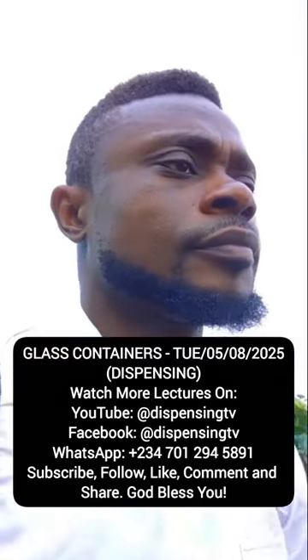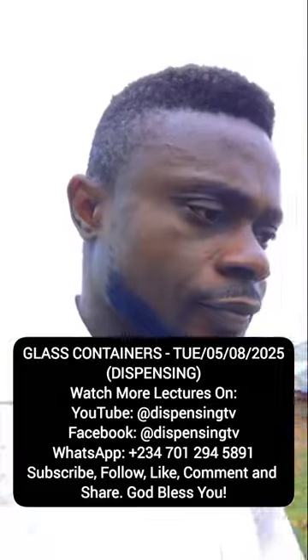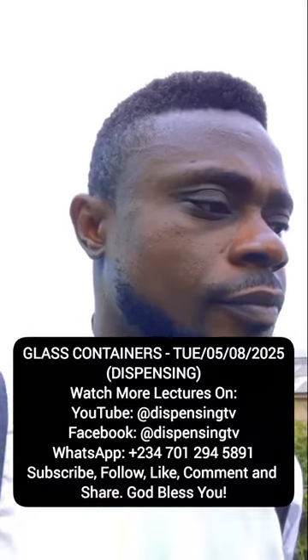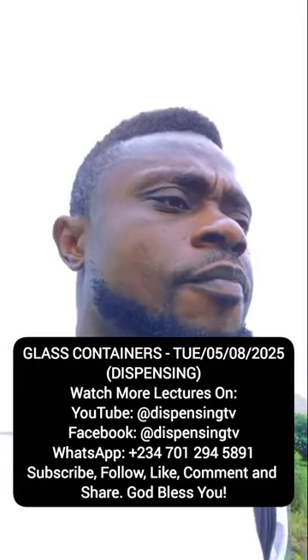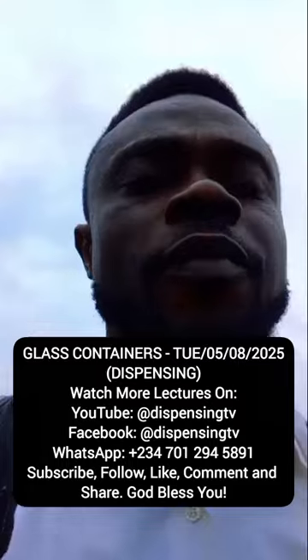Not like this. Don't snap it close to you. Snap it away from you like this. If it was ribbed well and the OPC is well indented, when you do that, you hear a pop. The glass will not break into pieces. So this is how to open what?